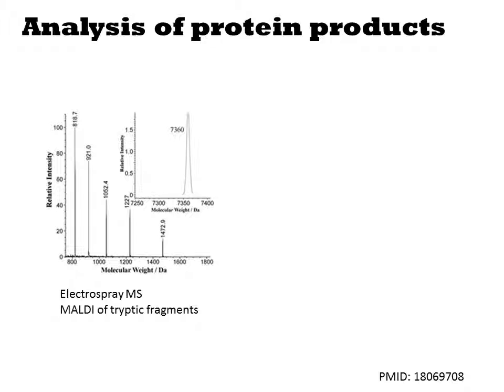In the case of the alpha hydroxy acid, the only difference between the desired product and the normal all-peptide product is an exchange of a nitrogen atom for an oxygen atom. Thus, the size difference turns out to be only 1 Dalton. However, electrospray is sufficiently precise to distinguish this subtle difference.